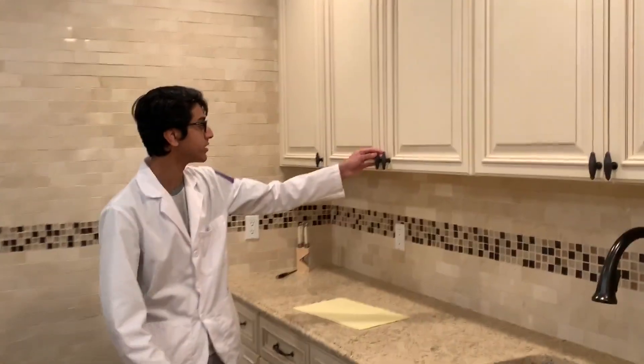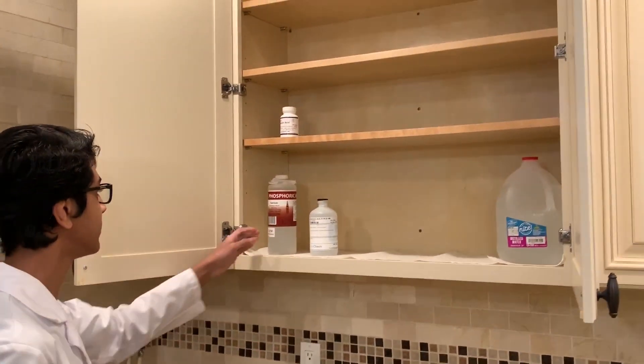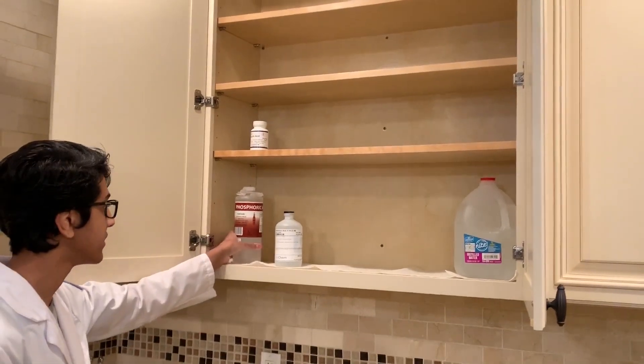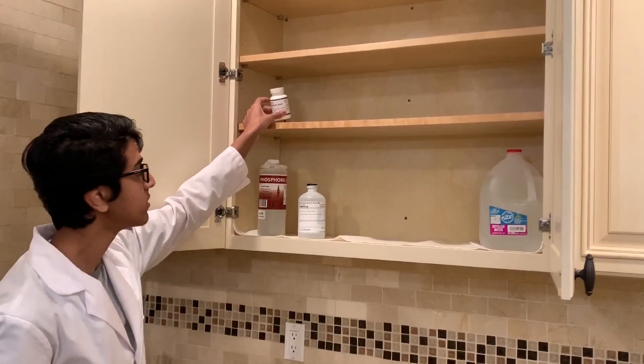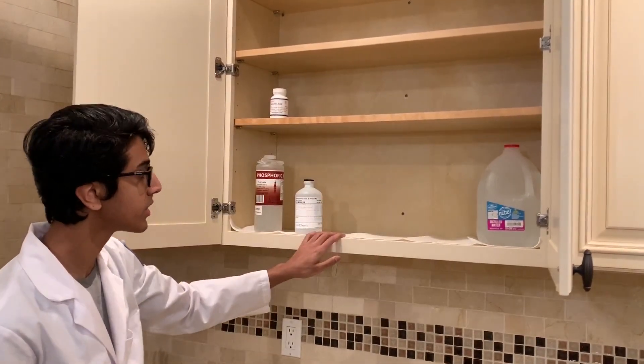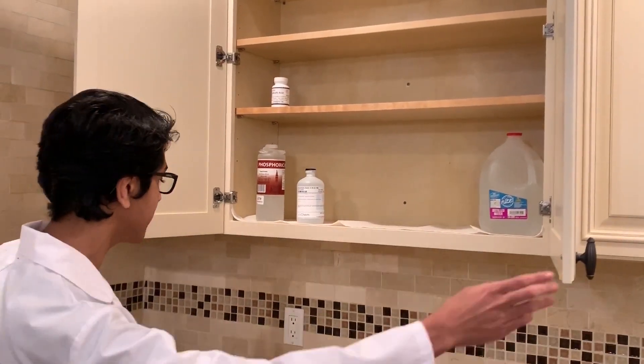Starting over here, this is where I keep all of my acids — phosphoric acid, hydrochloric acid, and salicylic acid, which I use in my wintergreen video. And over here I have distilled water, which gets used a lot in experiments.